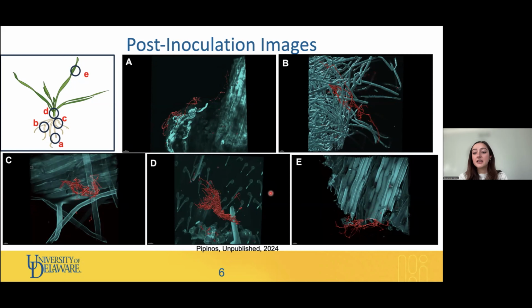And this region exhibited the most extensive formation of vegetative hyphae with lots of colonization on these hair-like structures known as trichomes. So a possible explanation for this high level of colonization is that trichomes can serve as microbial habitats, and a lot of bacteria are attracted to this region because there are potential openings for the bacteria to establish an endophytic relationship with the plant.